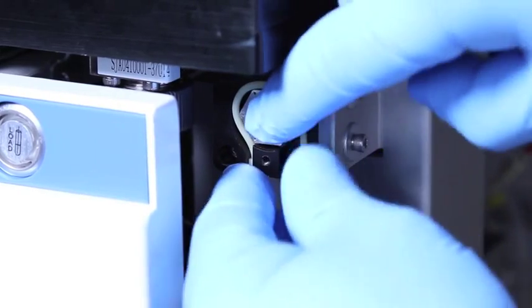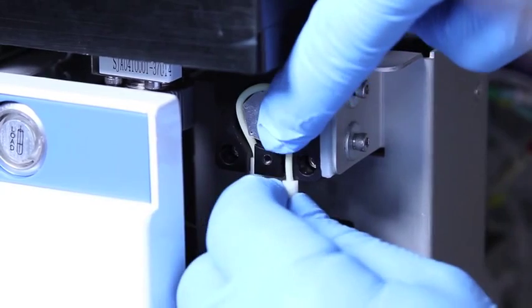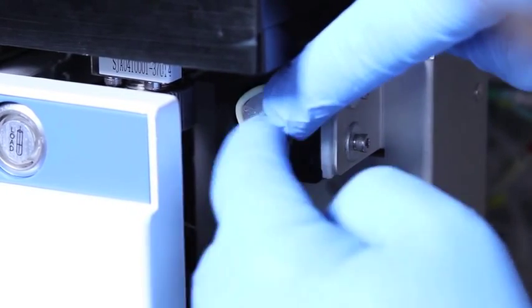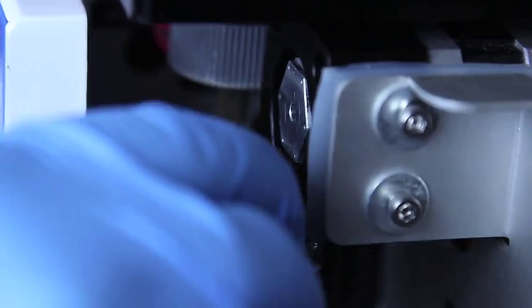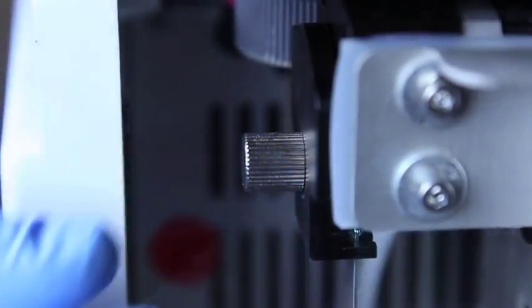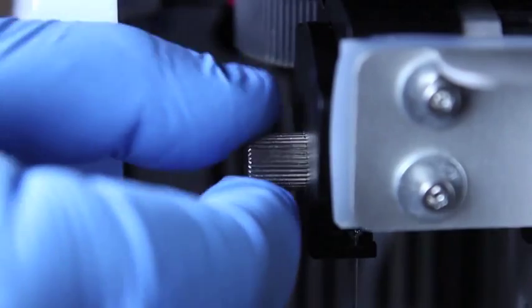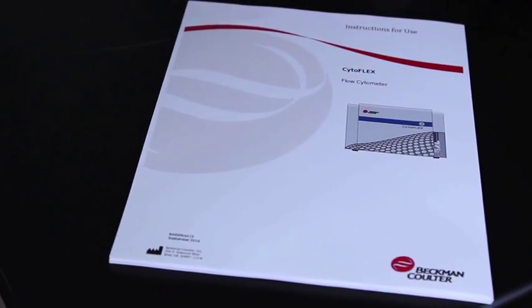Fit the new sample tubing into the peristaltic pump by inserting both stoppers and running the tubing into the peristaltic pump. Replace the cover by tightening the thumb screw. Please refer to the IFU for detailed instructions.